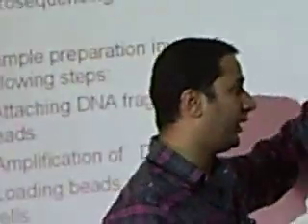And this whole master mix is then kept in the FLX instrument, where we add the nucleotides A, T, G, C. When the complementary nucleotide comes in contact with the template strand, the polymerase will extend the DNA and give a light signal. This light signal is detected by the CCD digital camera in the FLX instrument, which makes this technique an example of pyrosequencing. Now, the applications of this technique.